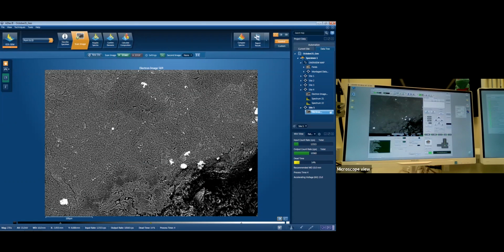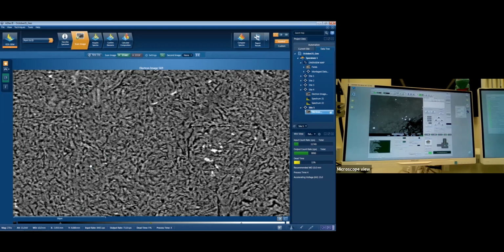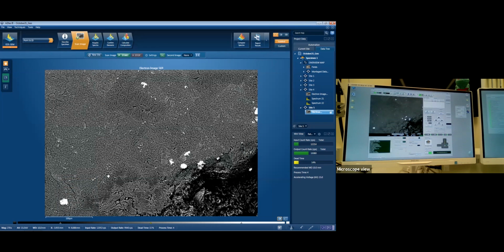You can see all these individual little crystals are quite small. Zoom all the way in I can on this map, which is just a digital zoom. It's not actually microscope. Lots of these things are still smaller than 10 micron, which is tiny for geology. There are some material scientists that we work with here, Tom and Dan, who'd be horrified to hear me say that 10 microns is tiny. But it is. It's very small for a rock.